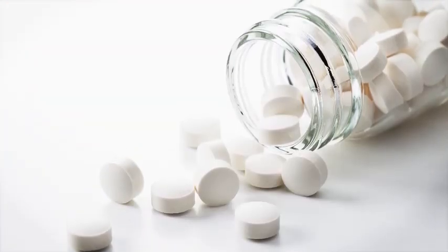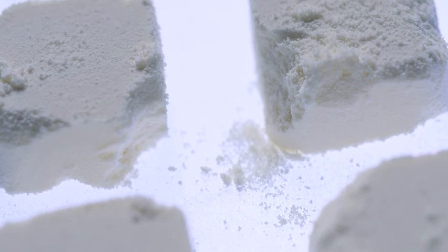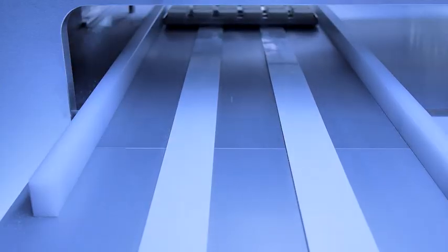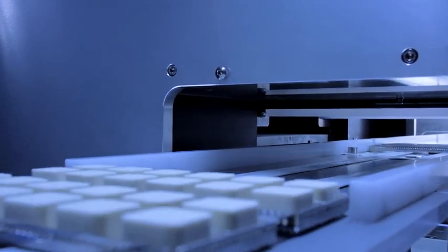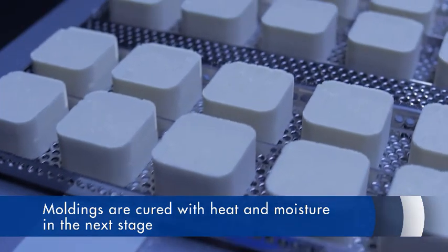The moldings used for orally disintegrating tablets need to be readily dissolvable. However, easy dissolution also means possible breakage. The lack of hardness has made it difficult to move to the next process after molding. The HPTM EX is a molding machine that creates high porosity moldings with low pressure in order to achieve fast solubility. The moldings are cured with heat and moisture in the next stage.